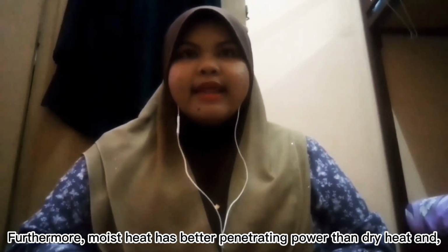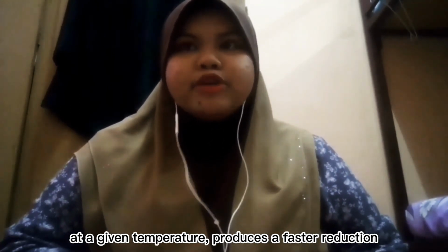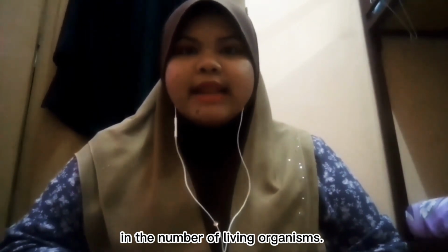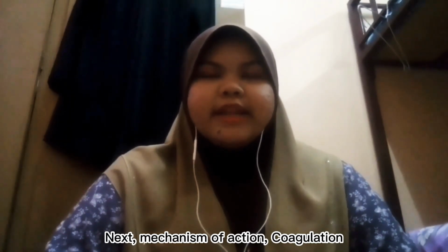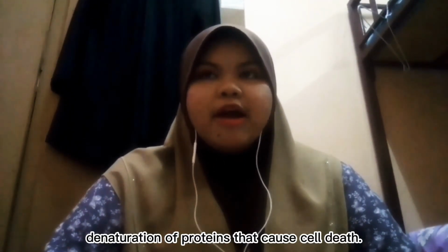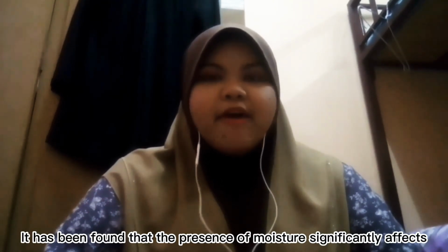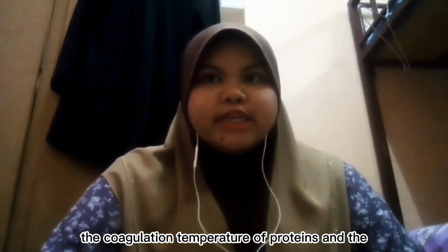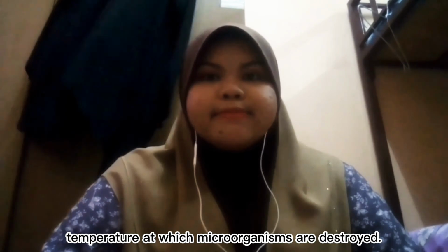Furthermore, moist heat has better penetrating power than dry heat and at a given temperature produces a faster reduction in the number of living organisms. Next, the mechanism of action: coagulation and denaturation of proteins that cause cell death. It has been found that the presence of moisture significantly affects the coagulation temperature of proteins and the temperature at which microorganisms are destroyed.